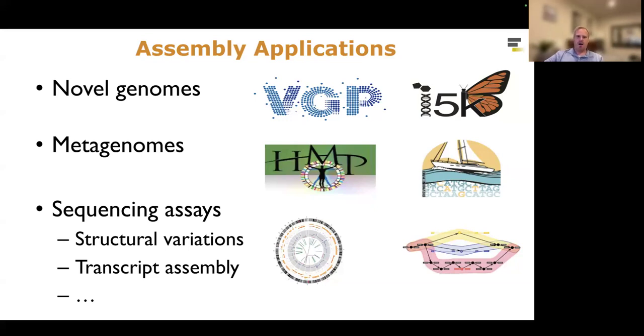If you're not so interested in DNA, maybe you're more interested in RNA. There are related approaches where you would do transcript assembly, where from RNA sequencing reads you would try to assemble the full transcript, in order to resolve all of the isoforms that are present there. And then beyond DNA and RNA, if you're doing, say, ChIP-seq, you could assemble the ChIP-seq reads to figure out the little contigs, the little regions where there might be protein binding, for example. So depending on the assay you're doing, these data structures and algorithms may play a really important role behind the scenes beyond just DNA sequence analysis.